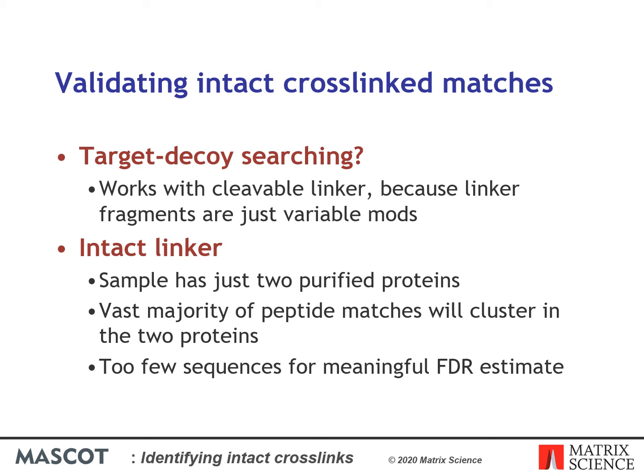The Mascot statistical model is robust and will give you reasonable separation between correct and incorrect matches, even in these adverse conditions. Nonetheless, it's prudent to keep a skeptical mind. Let's look at a few example spectra.